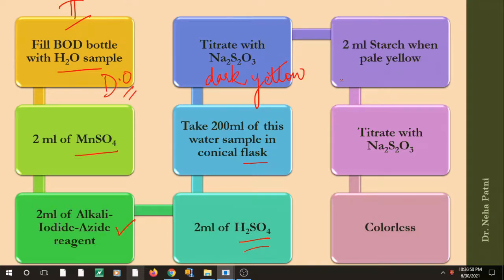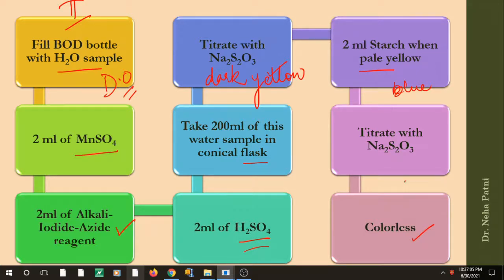The remaining steps are the same: titrate until it becomes pale yellow, then add starch — the color turns blue — then titrate again with sodium thiosulfate until it becomes colorless. At that point you record the reading. This is what you are going to do virtually.